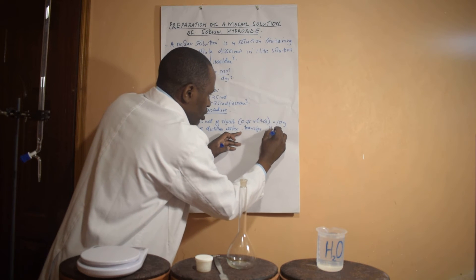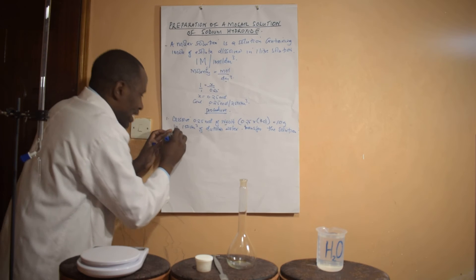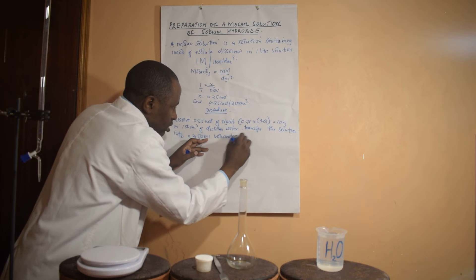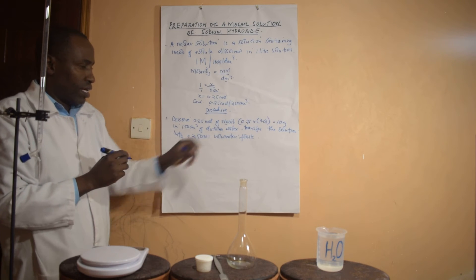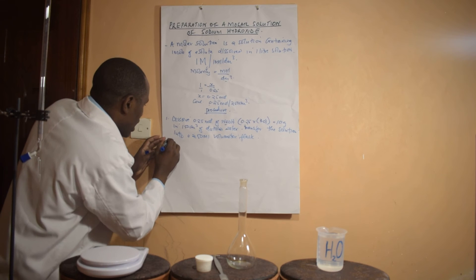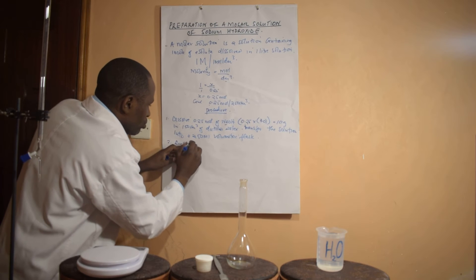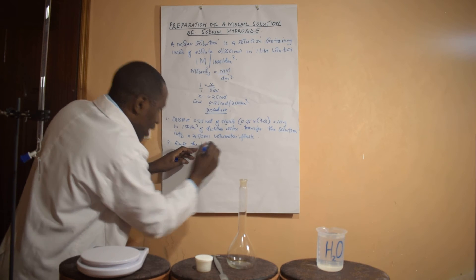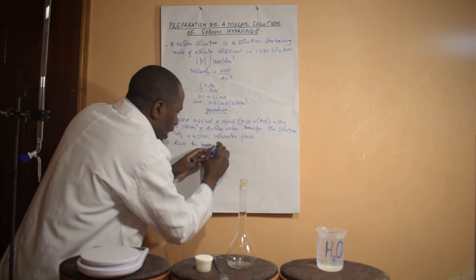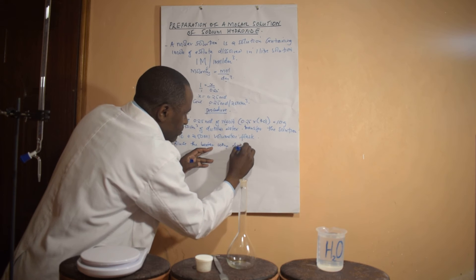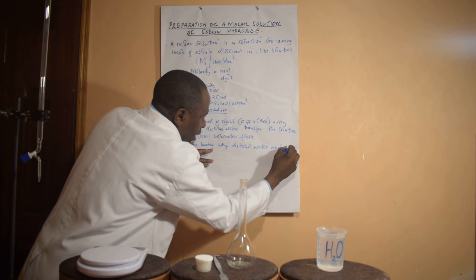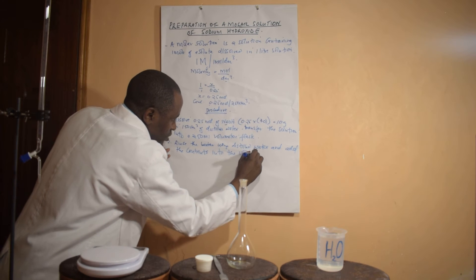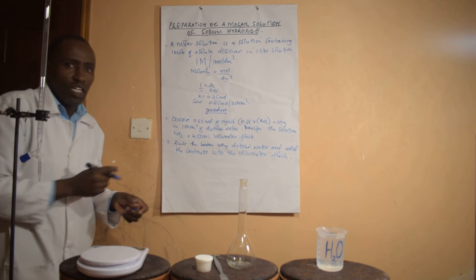Transfer the solution into a 250 mL volumetric flask. Then rinse the beaker — assuming you dissolved the sodium hydroxide in the beaker — rinse it using distilled water and add the contents into the volumetric flask.